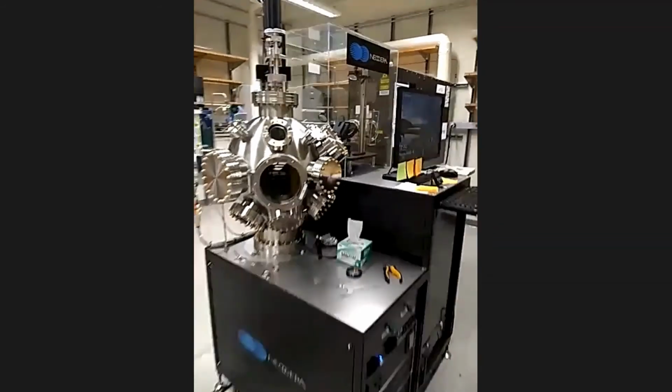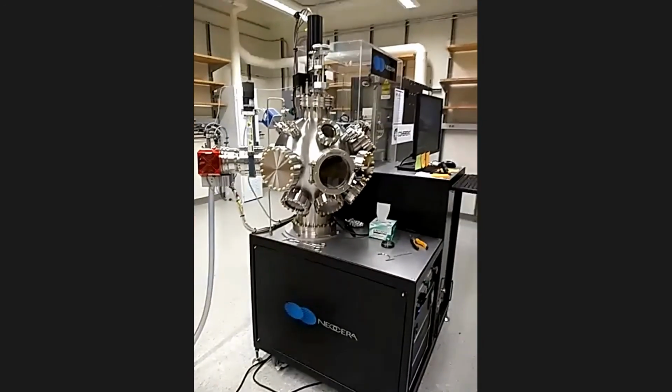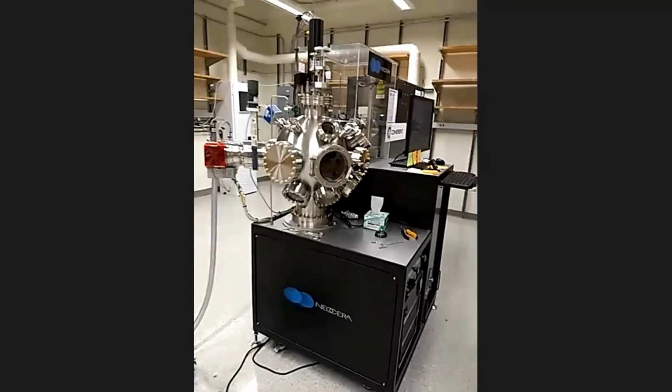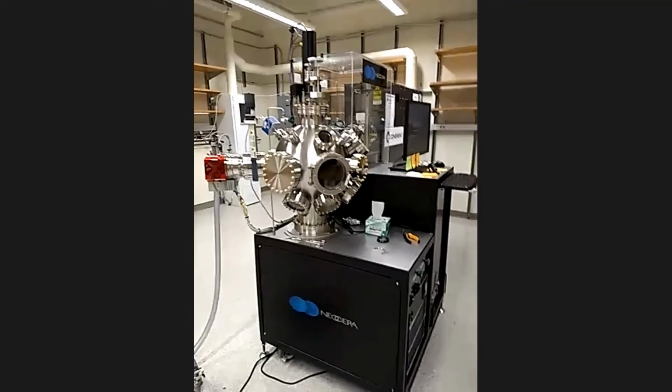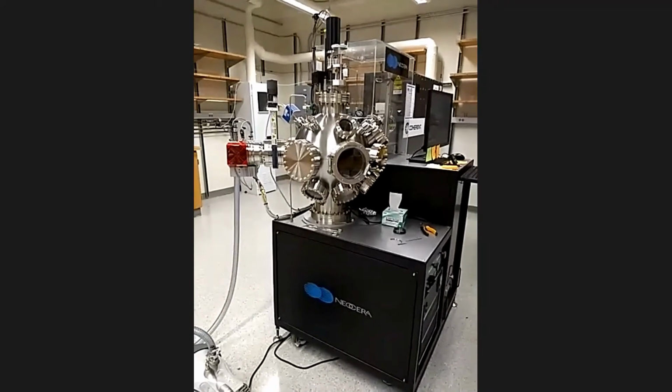Okay, then if there is no other, I'll stop sharing this video and get back to the next phase, which is the X-ray characterization. Now we have grown the sample. What after that? So I'll go to that part of the story now.